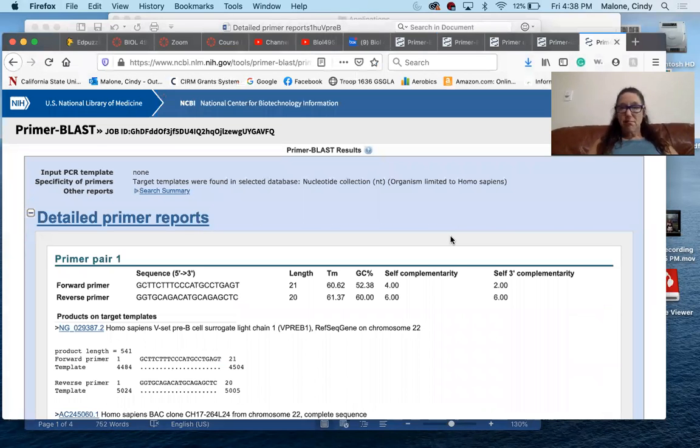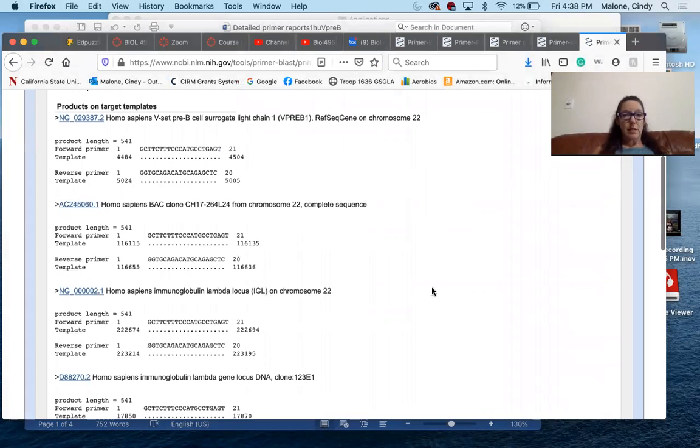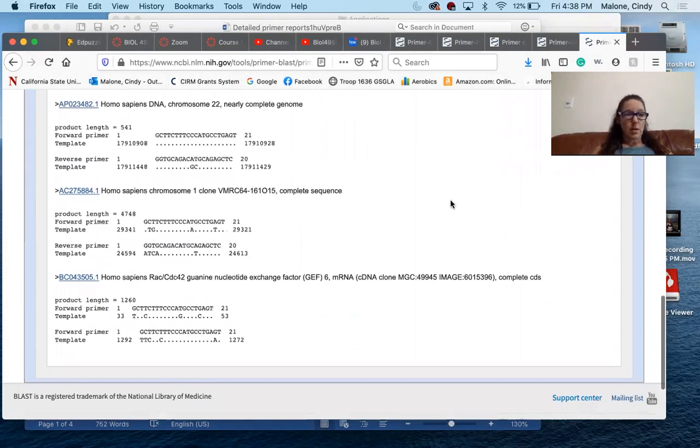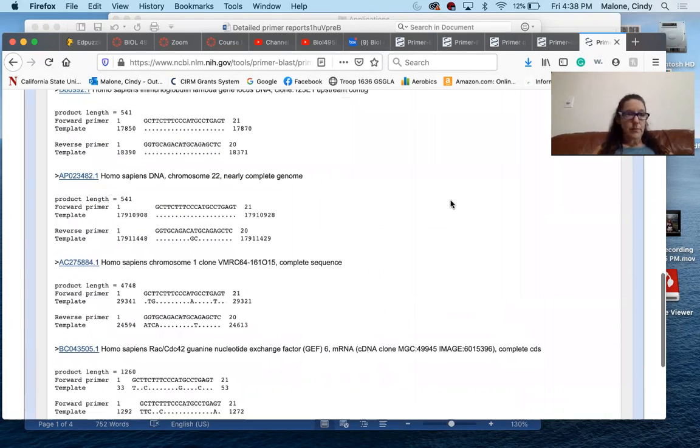this is really primer pair 2, right? Again, sitting on us, yay, chromosome 22, chromosome 22. Okay, so these are the only 2 it gives back, even though I said 20. So apparently that's all that it sits on. So that's good news. So what are we going to do?